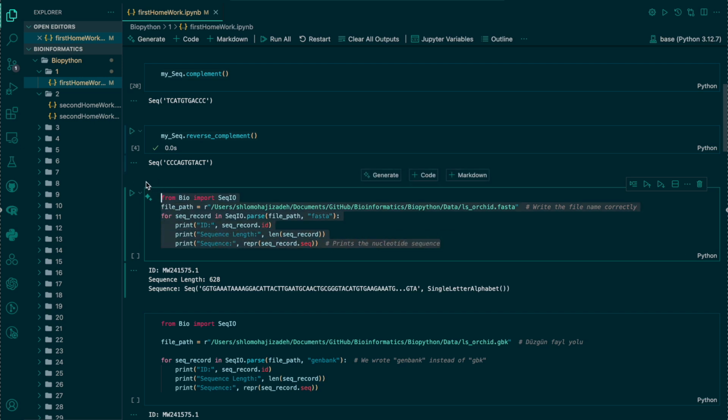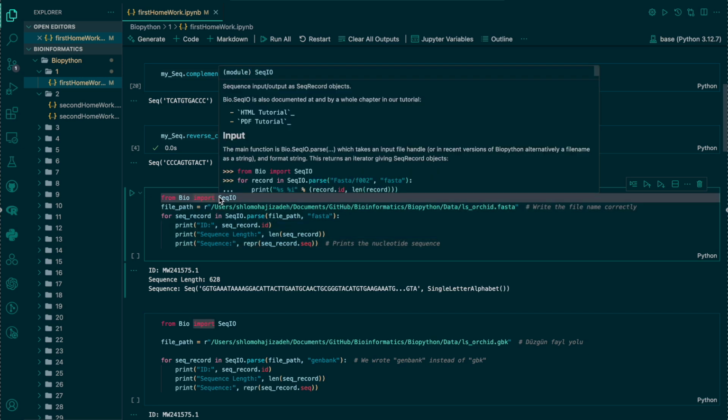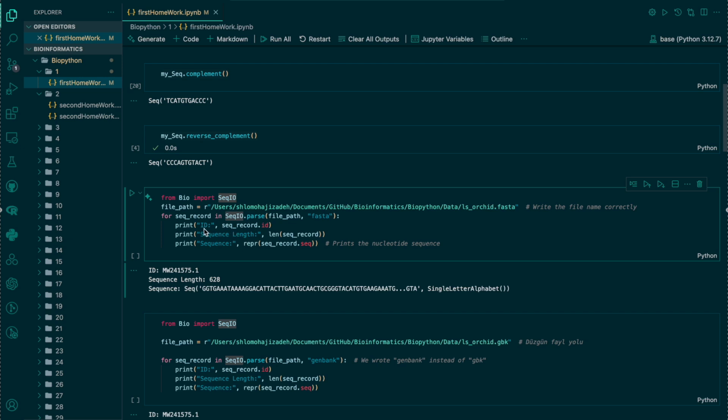This Python code reads a FASTA formatted bioinformatics sequencing file using the SeqIO module of the BioPython library and outputs the following information. 1. The ID number, for example, the ID number of the sequence, DNA or protein sequence.